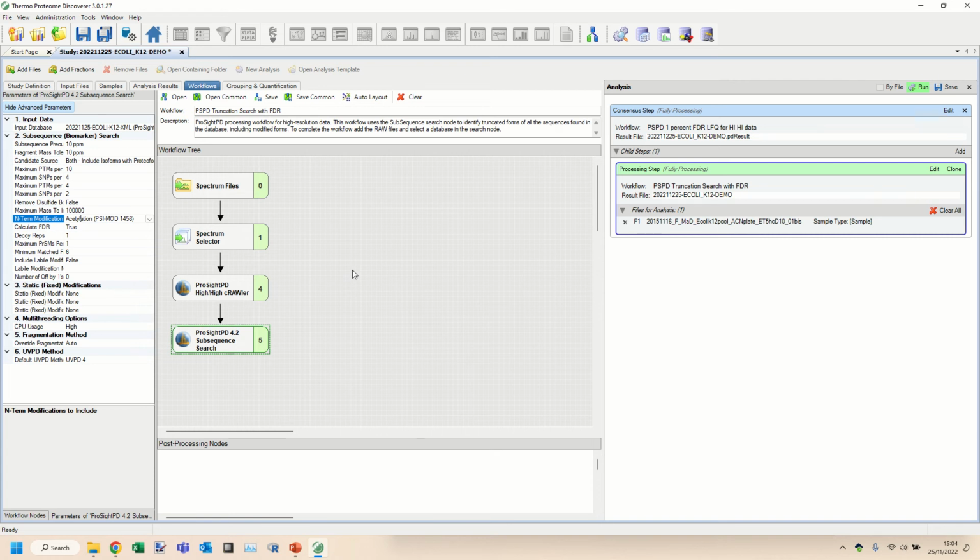You don't have to specify N-terminal acetylations in Database Manager. Instead, that's usually set up here under the N-terminal modification field. You can see that you can also consider things like pyroglutamation and formylation there, but we're not going to alter those at the moment. We're just going to allow for the possibility of acetylation. This does not require proteoforms to be acetylated, it allows them to be.